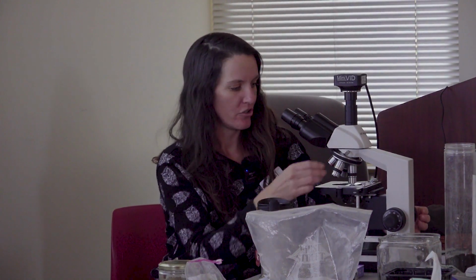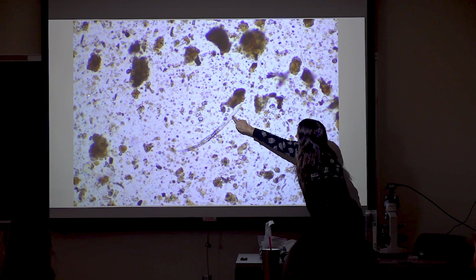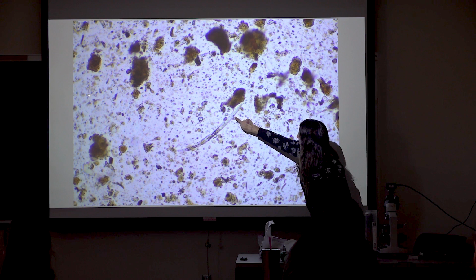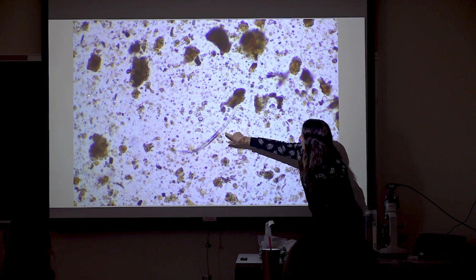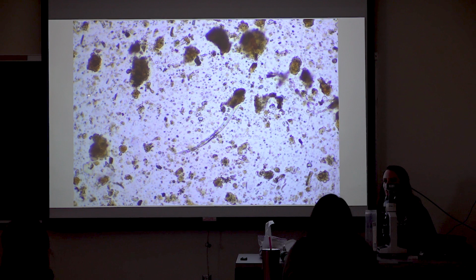And it is quite large too. And actually, the inside of the nematode, what are we looking at? Is there like organs? Yeah, so nematodes are not single-celled organisms. They have multiple cells, organelles, and things like that. There are different bulbs that are part of the digestive tract, which is another way that we identify different functional groups of nematodes. So you see there's a bulb here and a bulb here with that little T shape in it. Those are all part of their digestive and excretory tracts.